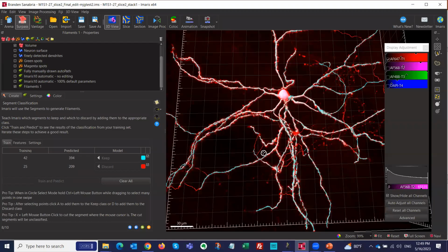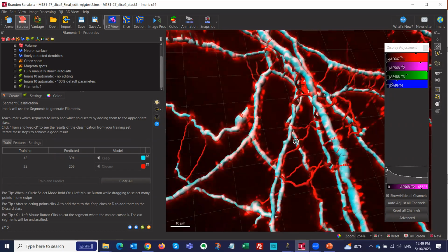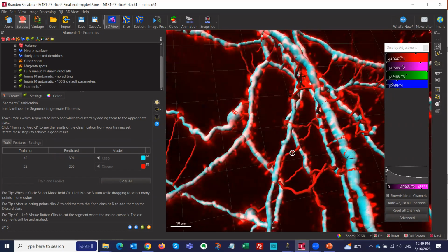So this is where beforehand we did the seed points, which were the individual points. Now it's connecting the seed points to make the segments, okay? And the segments, it's the same thing. Some of them keep, and some of them discard. And you can see those guys here, the connection between those. This is what I call the guitar strings. It connects different dendrites, okay?